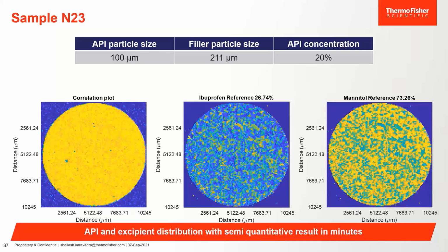And it showed a small defect on the tablet itself. So we excluded the spectra below a certain threshold from the concentration calculations, so that spectra in the corners like this are not taken into account when calculating the percentage API and the percentage excipient.